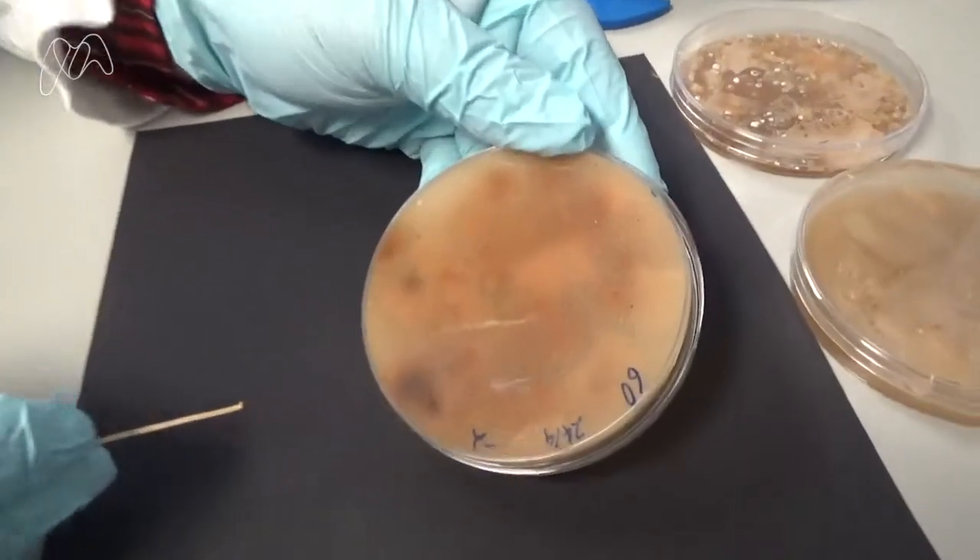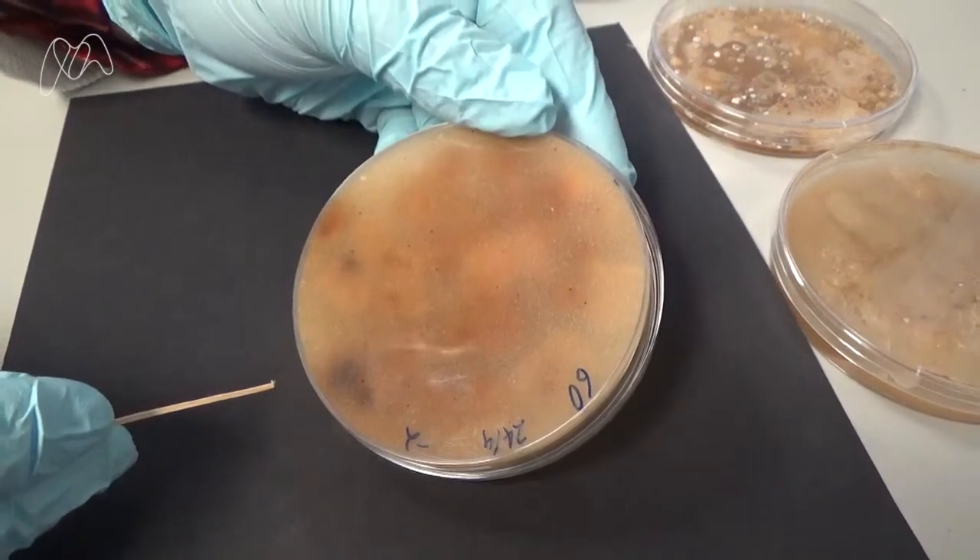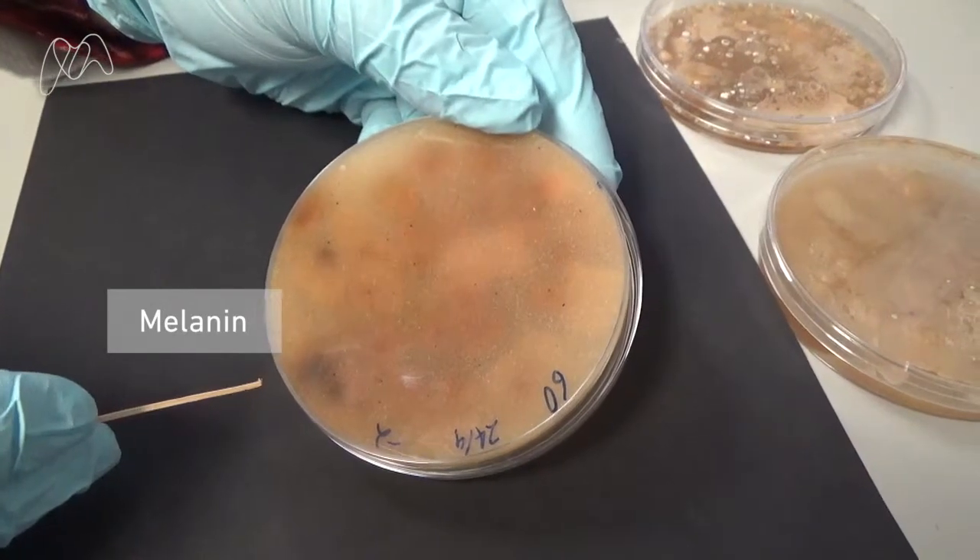Another thing that you'll notice is that there are dark spots on the back of the plate. This is a chemical known as melanin, which is another thing that Streptomyces tend to produce.